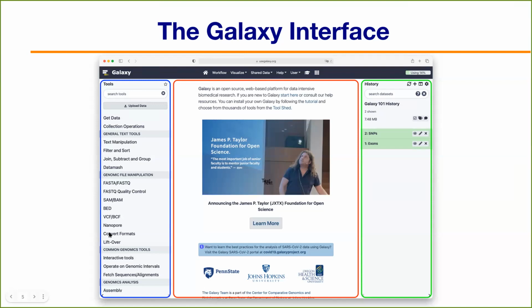the usegalaxy.eu server. So recently, for instance, I was working with some people who were working with Sanger data, and there's quite a nice little tool called Tracy for working with this. So I wrote some wrappers for the Tracy command line tool. And then I contributed the wrappers, again, like you've just heard about pull requests and things. So I made some pull requests to the tools-iuc GitHub repository that basically got reviewed by the people from the IUC group that checked that my tools were good quality. And then those eventually got added to the collection of tools you can install.